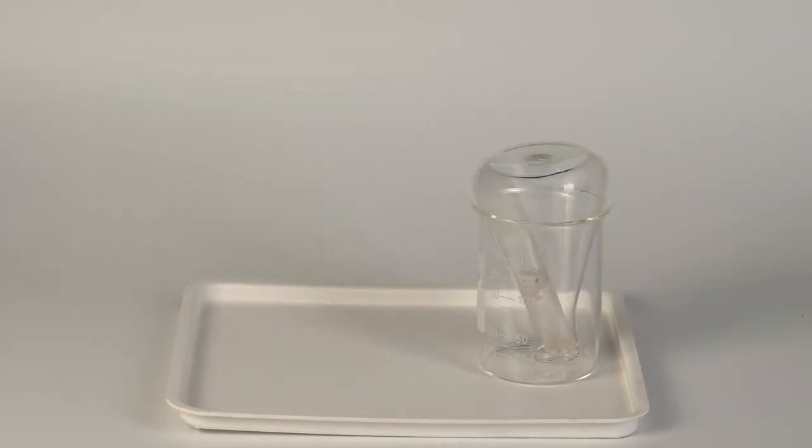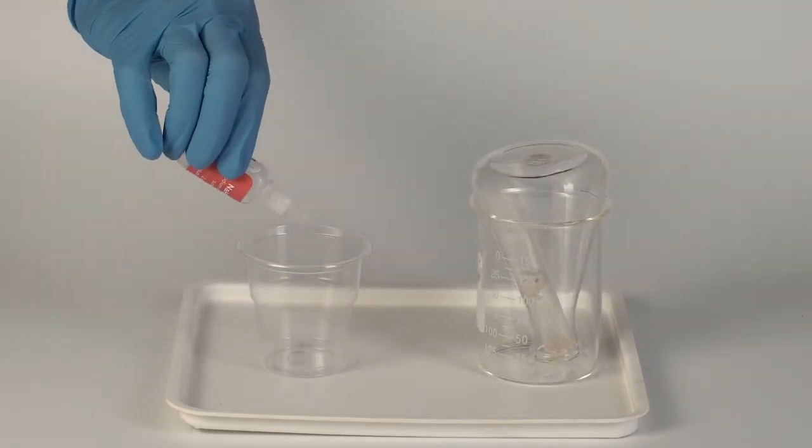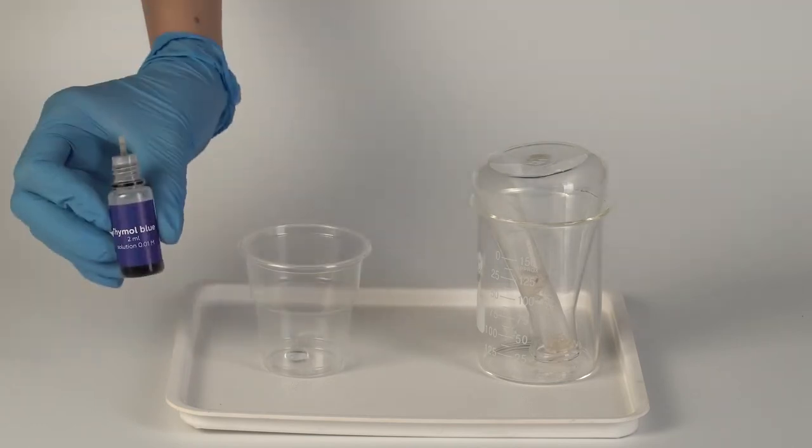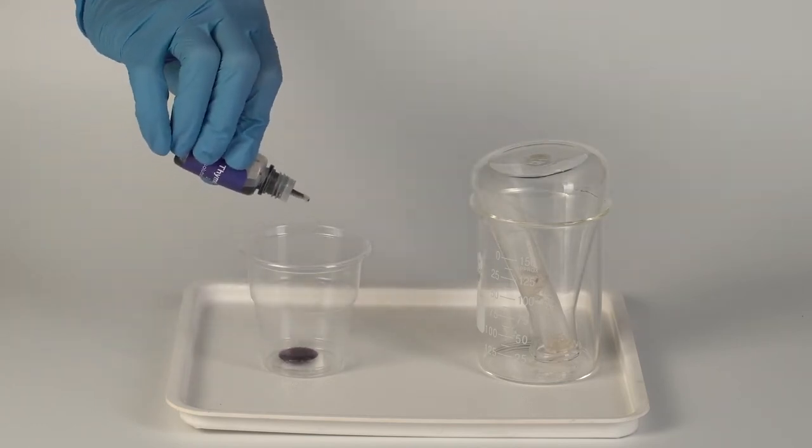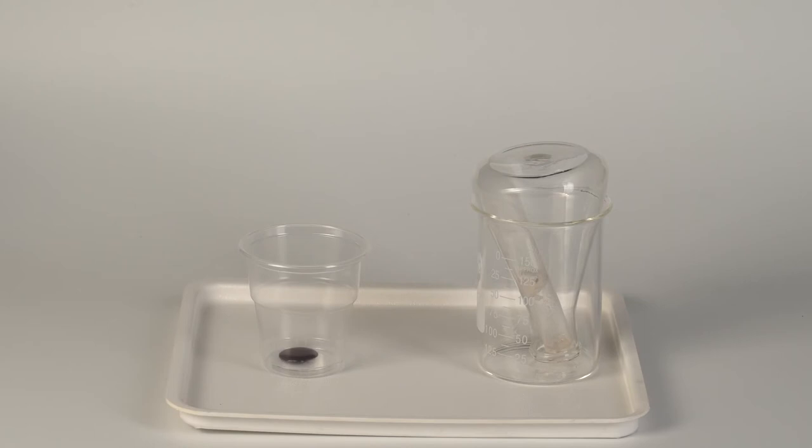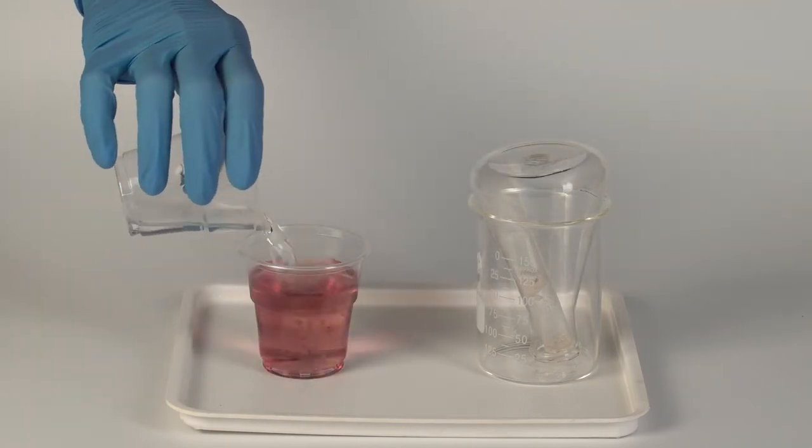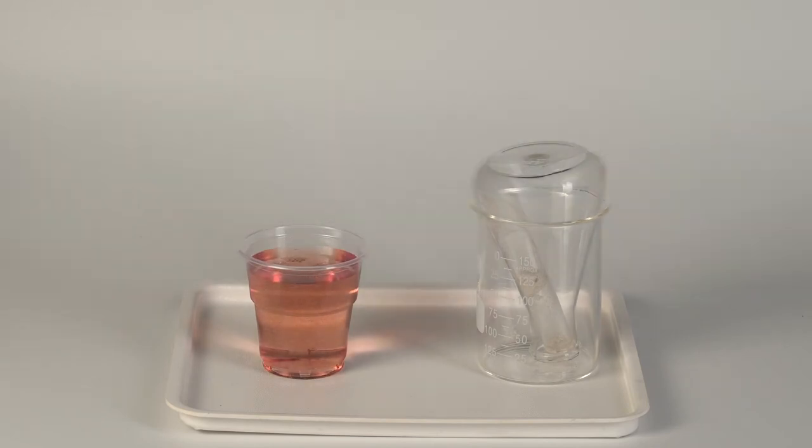Take a disposable cup and add 10 drops of sodium hydrogen sulfate solution to it, and then add 10 drops of thymol blue solution. Fill the cup to the top with tap water. The color of the solution is now orange, indicating that it is an acidic solution. Thymol blue is a pH indicator where orange indicates an acidic solution and blue a basic solution.